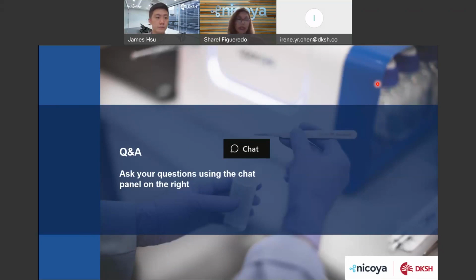However, we have worked with and been successful with nanobodies. So it would again depend on that size. So it is a possibility. You just need to have your ligand immobilized, and then your analyte could be your exosome. You would get a yes/no binding.